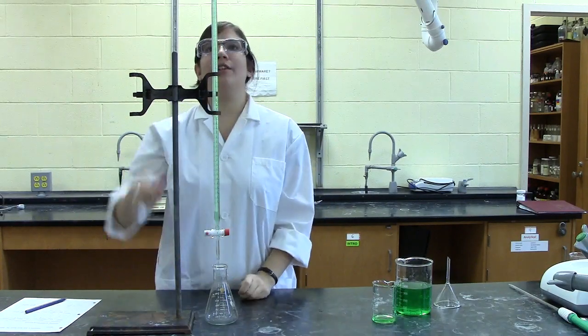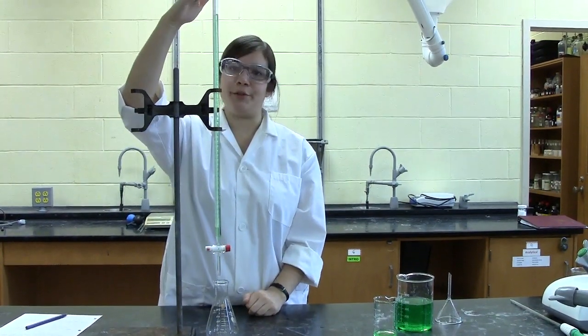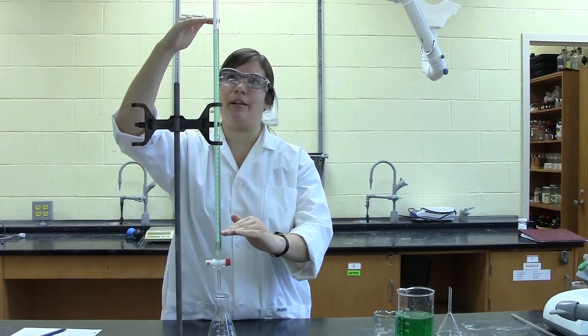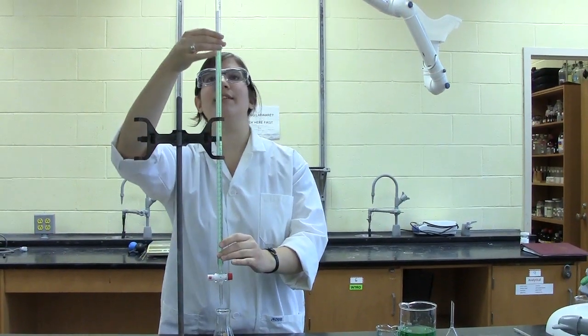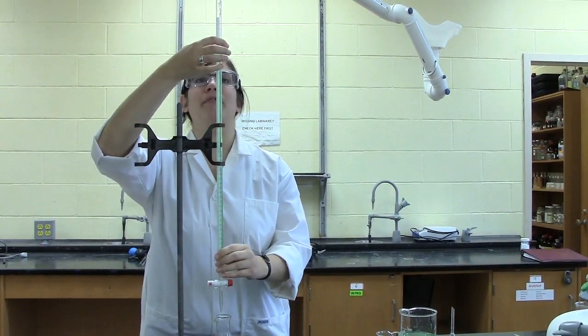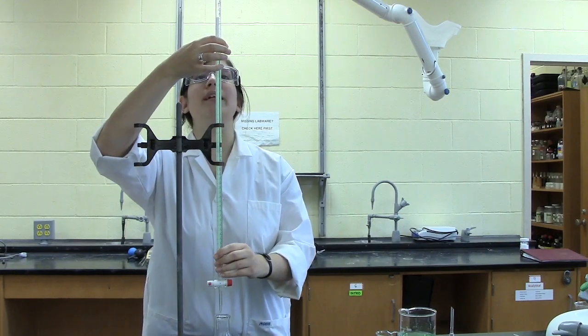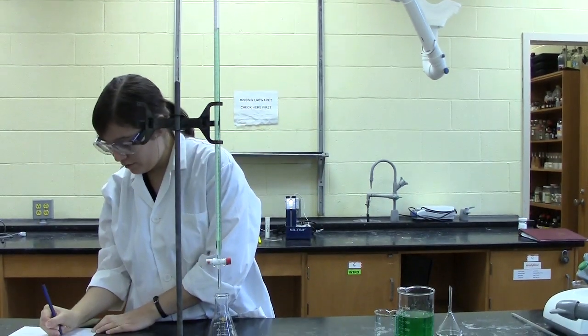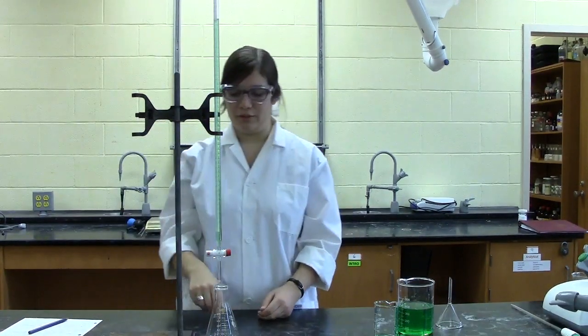Next, you can take your initial reading, reading from the top down. Burettes go from zero milliliters at the top to 50 milliliters at the bottom. So in this case, I'm reading about 5.80 from the bottom of the meniscus. It's also important that you make sure all your readings are two decimal places. Record that initial reading as you'll need it later.